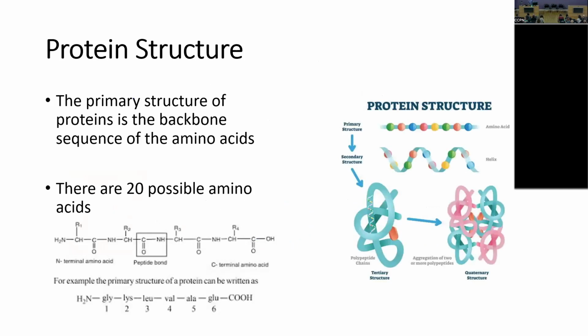The investigation of protein structure is important, which gives insight into the function of proteins, which is then used for various drug discovery and for understanding of disease mechanisms. The first step in the investigation of the structure is the assignment of the backbone. The backbone is the primary structure, which consists of sequentially connected amino acids through peptide bonds.